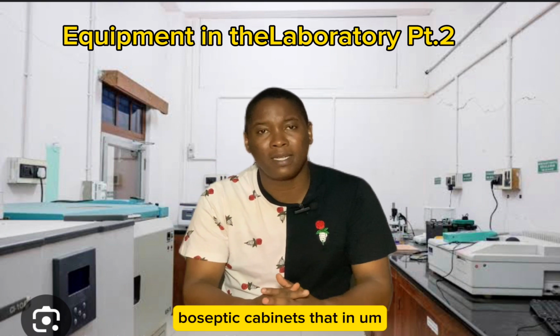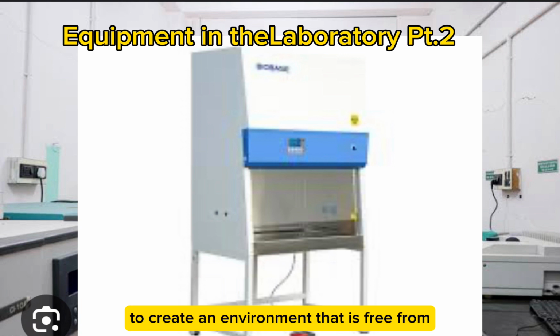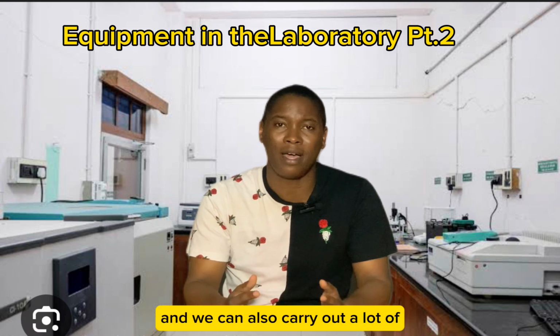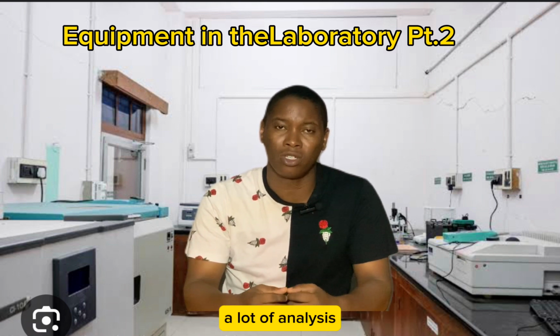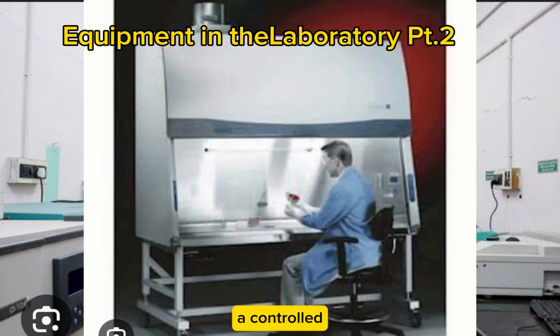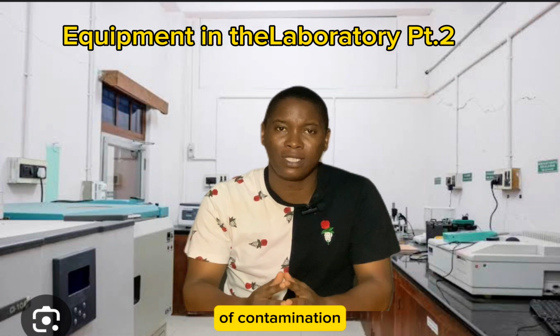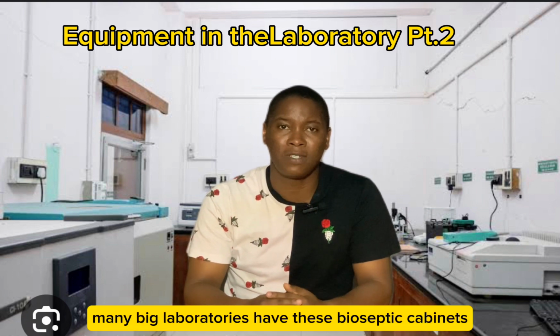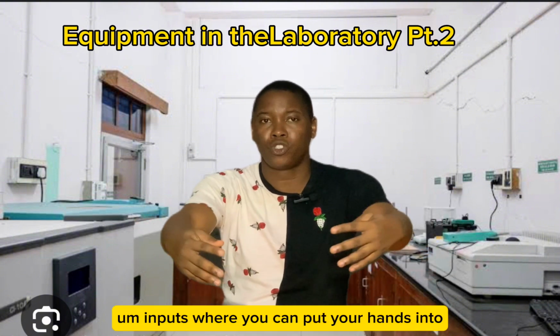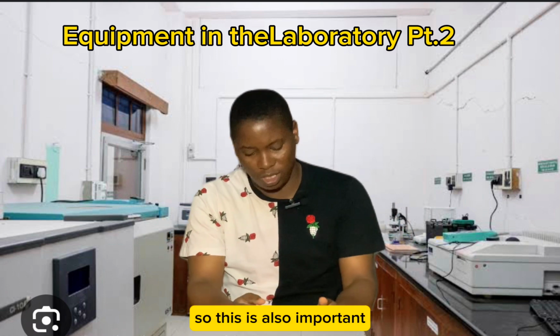cabinet. Biosafety cabinets are interesting cabinets that have been designed to create an environment that is free from contamination. Within these biosafety cabinets, we can store a lot of materials, and we can also carry out a lot of experiments and analysis. The biosafety cabinet provides a controlled environment where materials can be handled, free of contamination. Many big laboratories have these biosafety cabinets. You can see some biosafety cabinets have inputs where you can put your hands in and run many experiments in these safety cabinets. So this is also important.